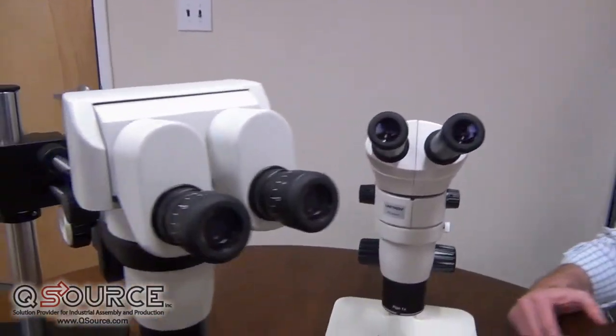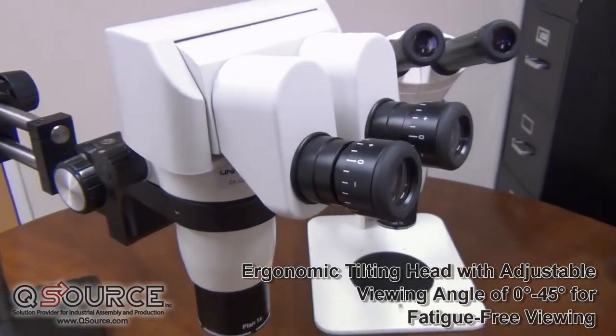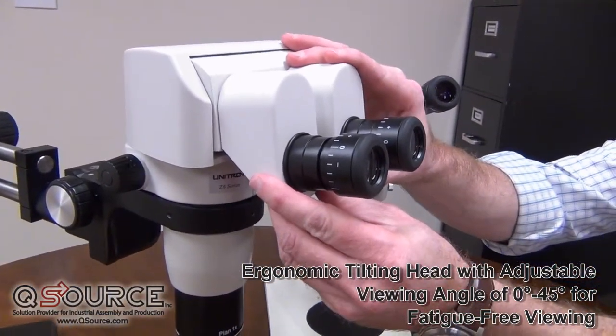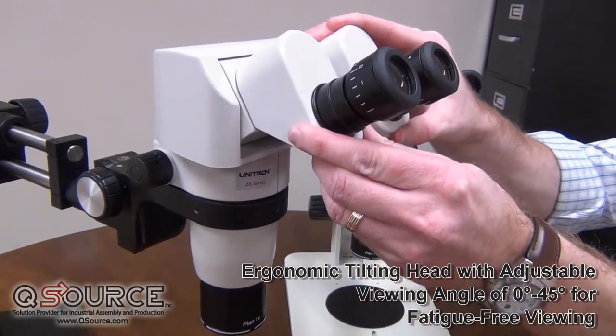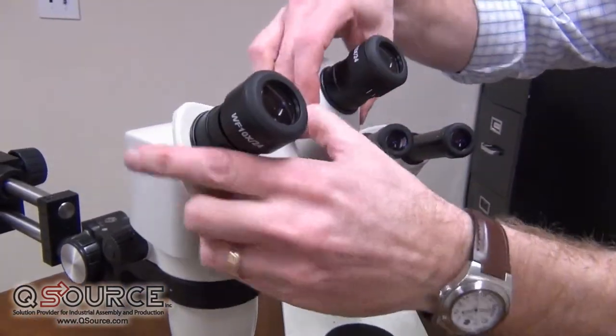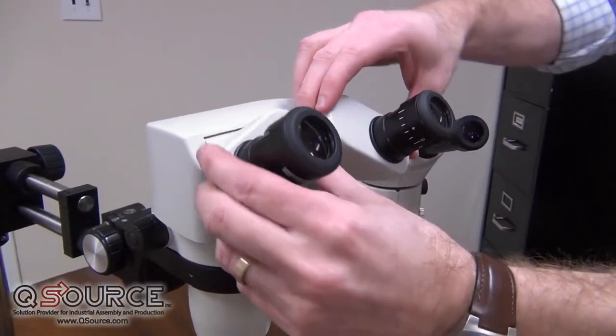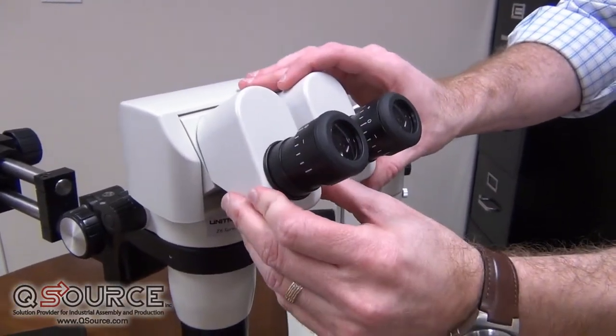Another option is to use the ergonomic viewing head. Here you'll probably have the most comfortable viewing option choices. The eye tubes can be angled in any which direction to fit a user's needs — they can swing up to give you more height adjustment, or move lower to accommodate users with a lower profile.